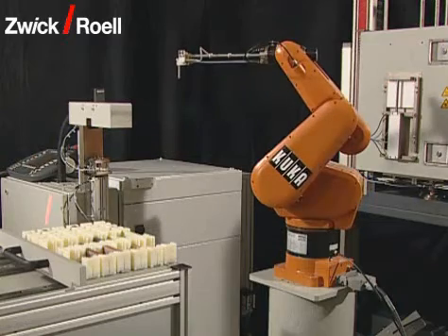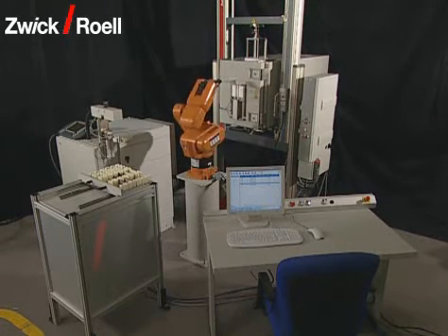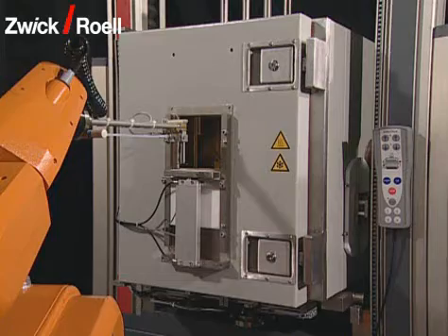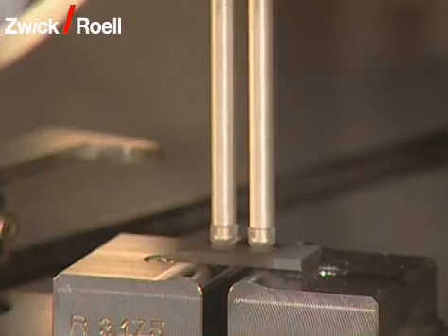If necessary, the specimen can be shifted with the robot and thus the cross-section can be determined at several parts of the specimen. Once the required temperature in the chamber has been reached, the specimen is transported to the testing machine and is introduced into the temperature chamber via a door.